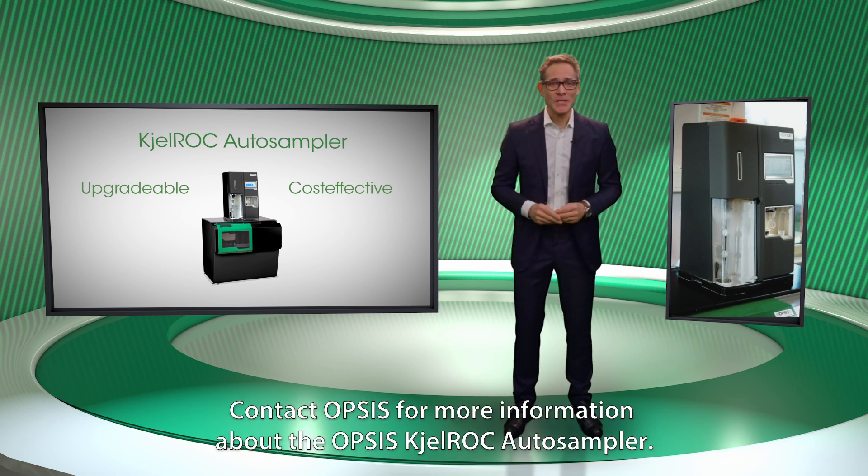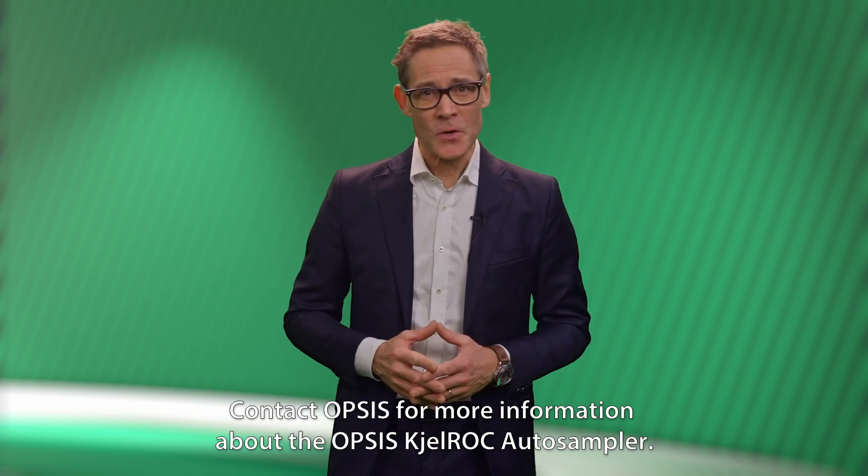Contact OPSIS for more information about the OPSIS KjelROC Autosampler.